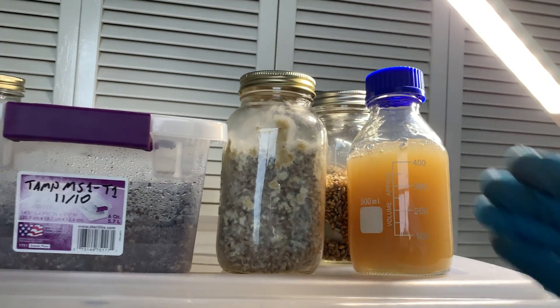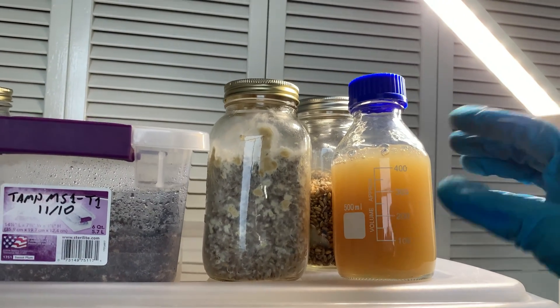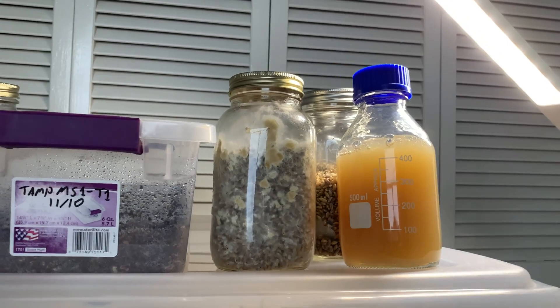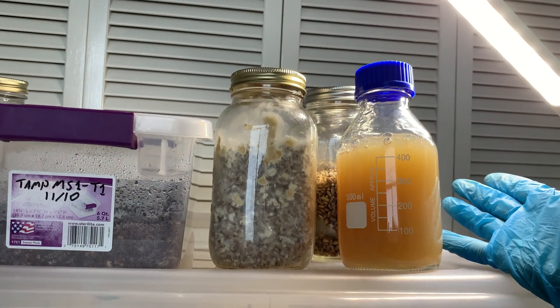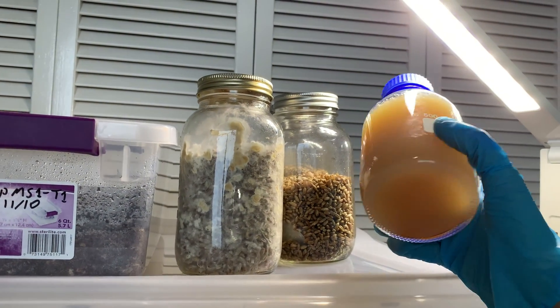So basically the agar solidified, or started solidifying, on the bottom and it was unpourable. I was like, okay, I don't have time to heat this back up and then wait for it to cool and then start pouring. After pouring I like to wrap my plates — I know some people don't, but I like to do it to be safe before I use them. So I didn't have time for that whole process because it takes hours.